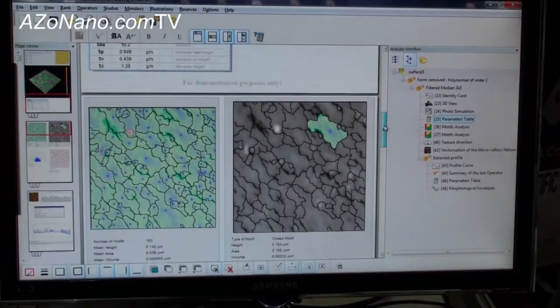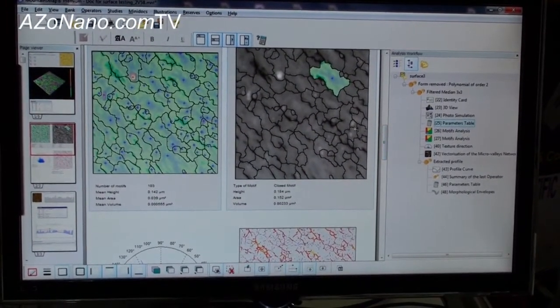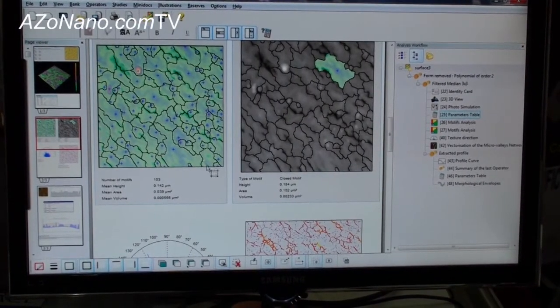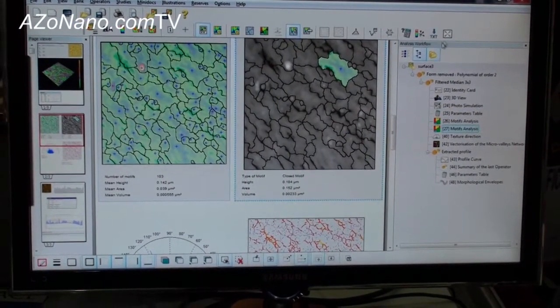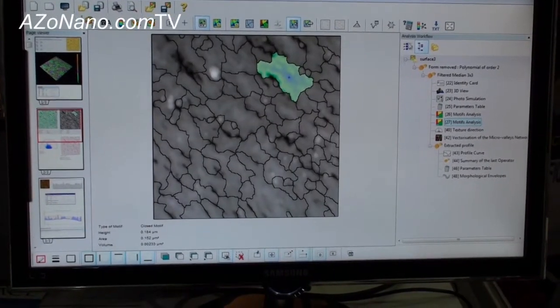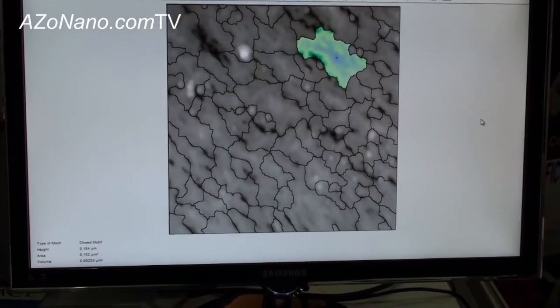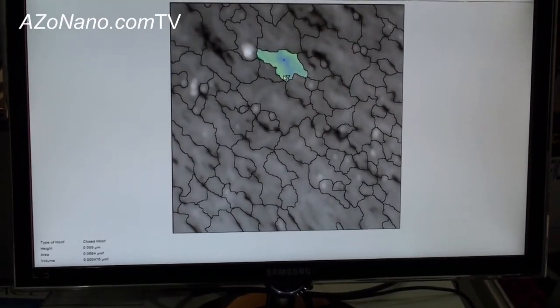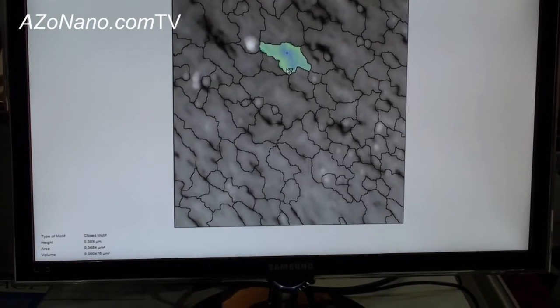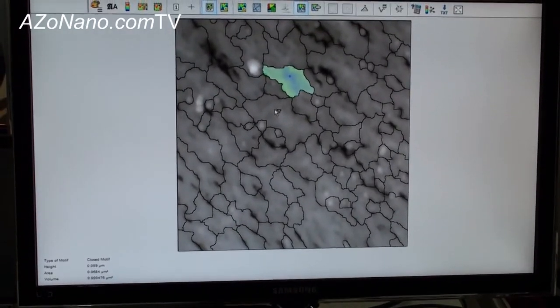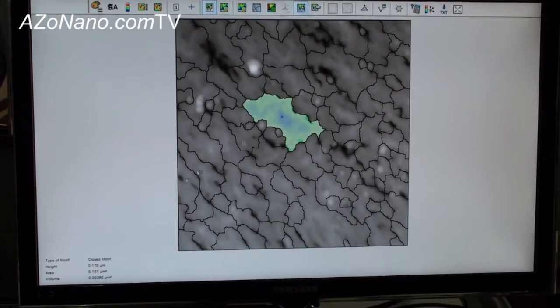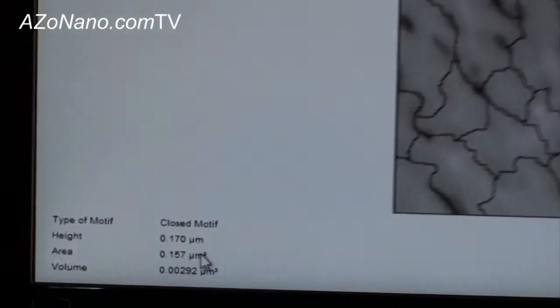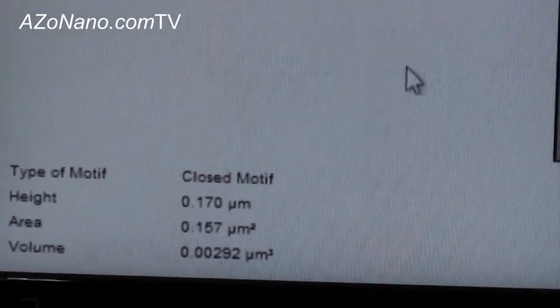So in this document, you have some advanced analysis from the last ISO parameters. For example, here you have the motif analysis, which is a pattern analysis. So anytime you want to know about the specific characteristics of the single motif, you can click on it and get on the bottom left the information about the size, the height and the volume of the motif.